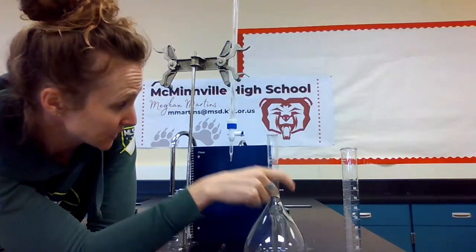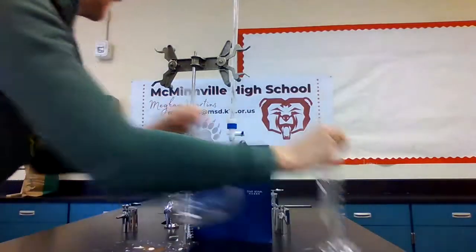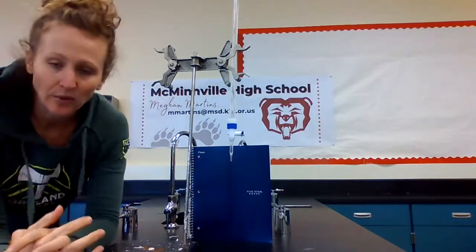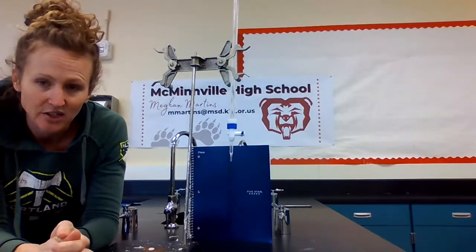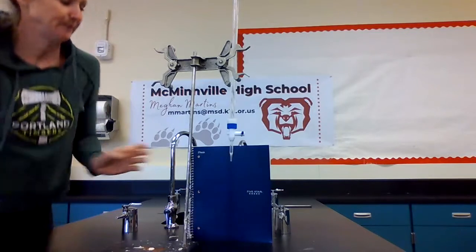All right, so today we're going to talk about titration, so we're going to use the burette. Now I want to talk you through a titration setup, and then also walk you through a mock titration so you see what's going on. As I pull out the different titration equipment, I want you to try to name it and tell me what it's for.